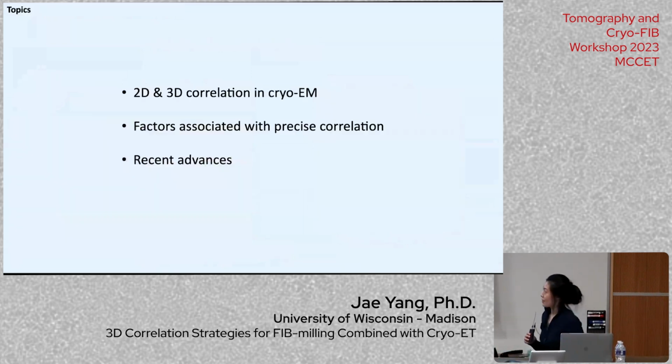So we're going to talk about targeting in a very detailed way, hopefully, and then we're going to talk about 2D and 3D correlation. We're going to talk about factors associated with precise correlation, and along the way, we're going to discuss some recent advances in the field.